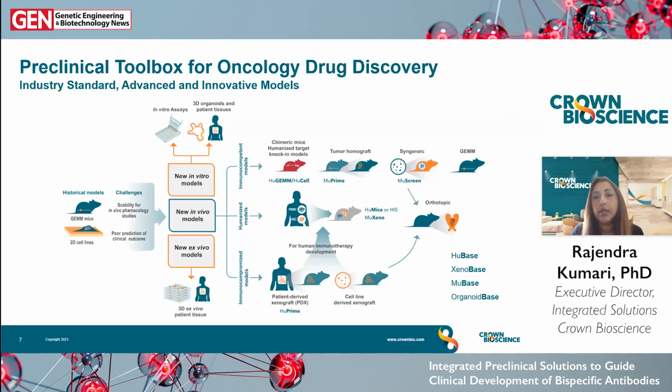So when it comes to evaluating some of these strategies in preclinical models, it can be difficult knowing which models can be used to answer such questions, either in vitro or in vivo. And there are a lot of options and new technologies, like I mentioned, that have emerged to improve the predictive and patient relevance, compared with the original historical models, which were seen as being poorly predictive, which is shown on the left-hand side. So you can see the emergence of new models as you move to the right.